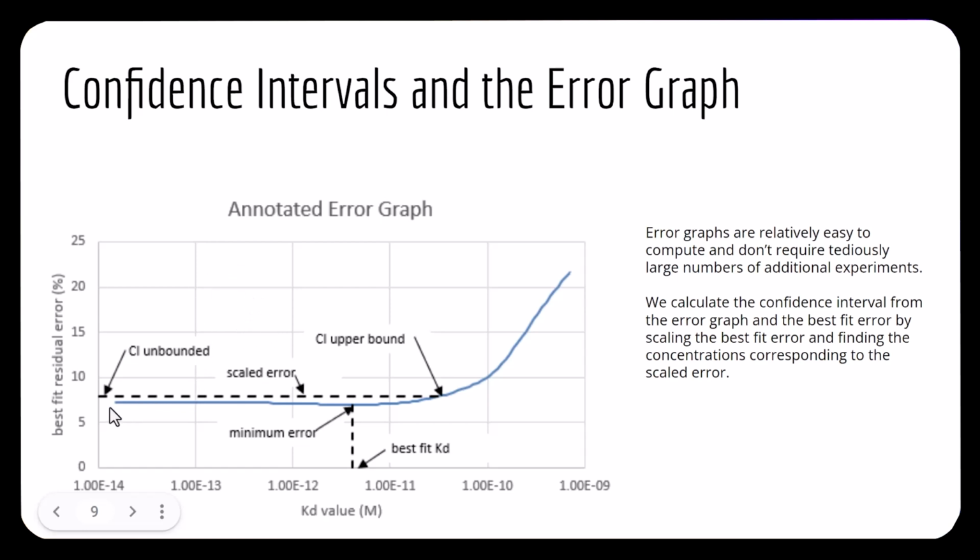And when we get about 300-fold below the best fit in KD, so the best fit was, I don't know, 5 or 6 picomolar here probably, we've gone down to 20 or 30 femtomolar here. And that's far enough. That's 277 or 300-fold below the best fit. So we quit looking. We say this is too flat.